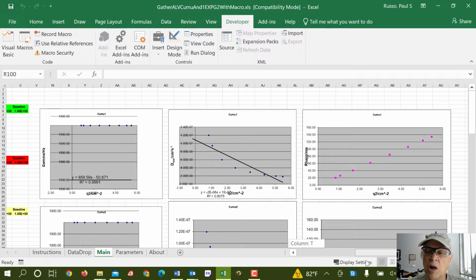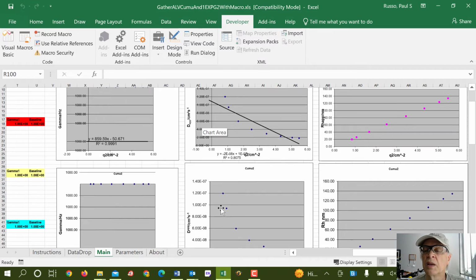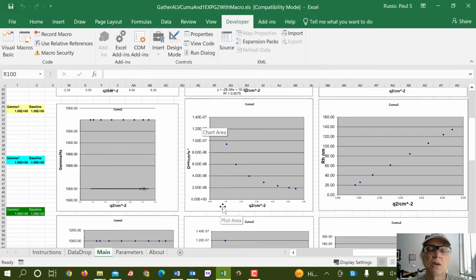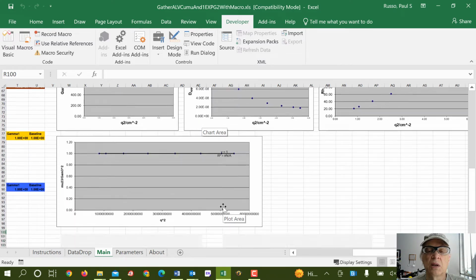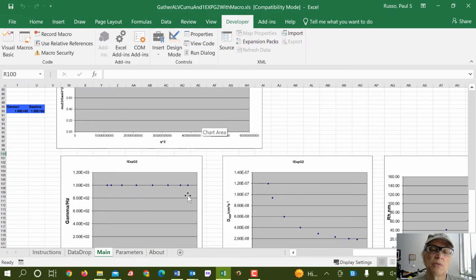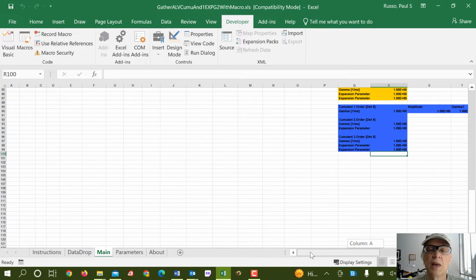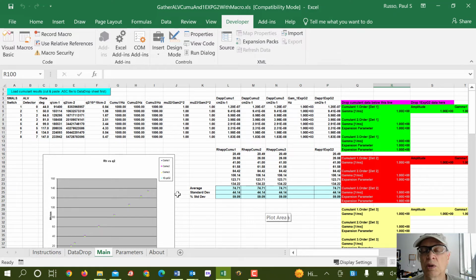And right now you'll see some plots. The plots that it will generate for us are cumulant data and cumulant 2 data, cumulant 3 data, and then it will get mu2 over gamma bar squared parameters. It also will generate for us 1 exponential G2 data if we have dropped that in, if we've done that analysis. The data set we're dealing with today is just not really appropriate for that, so I don't have that. But I'm going to show you where you would drop it anyway.